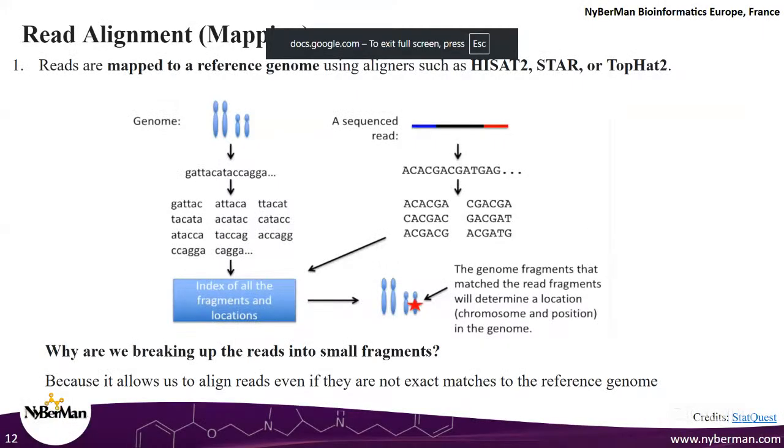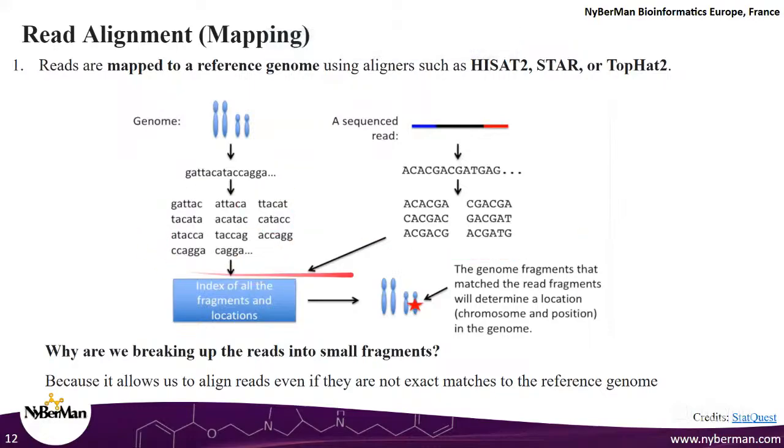So this is the general idea, the basic idea. But it's not as simple, right? Just like we break up the genome, we also break up a single read, right? And there is a reason behind that. Okay. So just for now, assume this is the read that you have generated, and you break this up again into 6-mers. Okay.